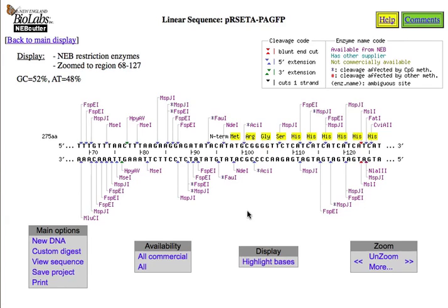Now we're looking for restriction sites. They need to be within the open reading frame for the protein. What I mean by that is if I clone out here my piece of protein from the PLC gamma, it is not going to be fused with the gene for GFP, because here's the start codon for GFP. Now I would have to have a start codon on my protein. They would have to be in frame with each other to make two proteins. That may work if you had a start codon, but we're not going to be using the beginning of the PLC gamma protein. So I have to embed my protein inside of the GFP.